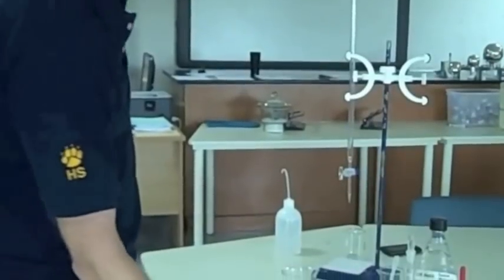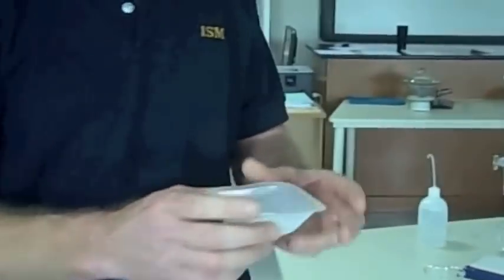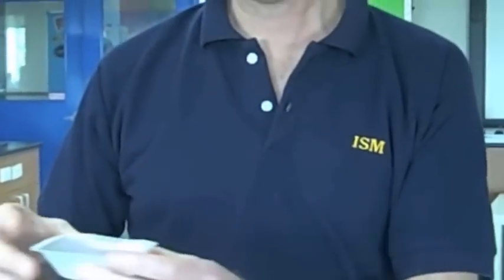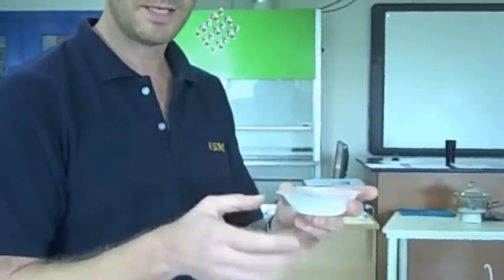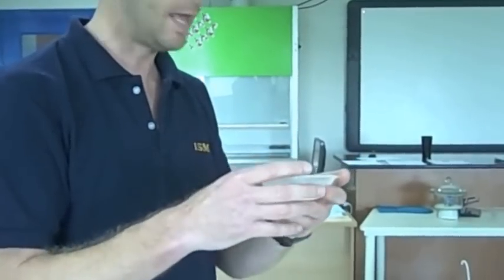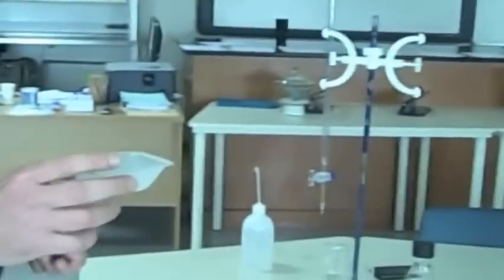The first thing it asks you to do is to weigh out approximately 1.5 grams of the oxalic acid. I've done that already. I've measured approximately 1.5 grams into my weighing boat using a balance, but I do know precisely to three decimal places what the mass of both of these are — the weighing boat plus the acid. So the first thing I'm going to do with that is dissolve it in distilled water.